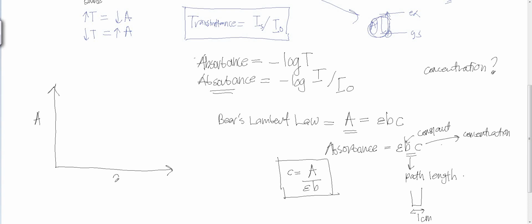And then you want to relate with the concentration. For example, this is not the spectrum. Spectrum is the one that you get from the UV ray study dalam bentuk peak dan sebagainya. But this is the one that you want to know the correlation based on the Beer-Lambert law. Beer-Lambert law says when the absorption is higher, automatically the concentration will be higher. Okay, jadi apabila you try to plot the concentration, you have 1, 2, 3, 4, 5. So for example, concentration in ppm unit.